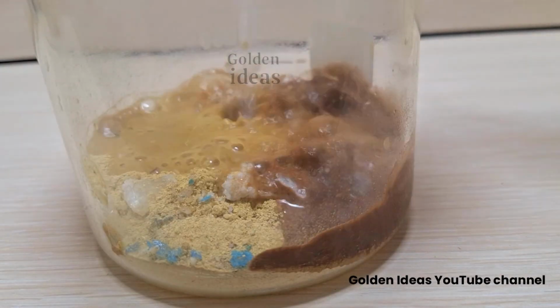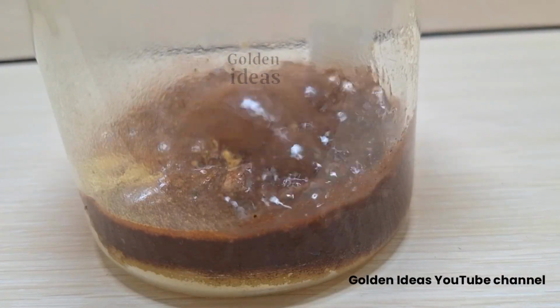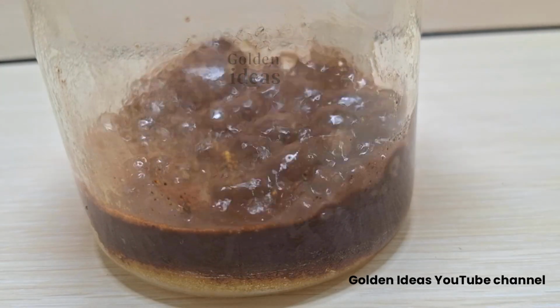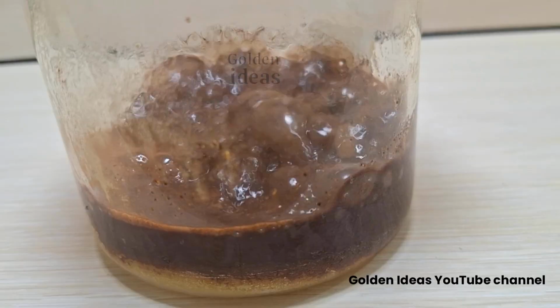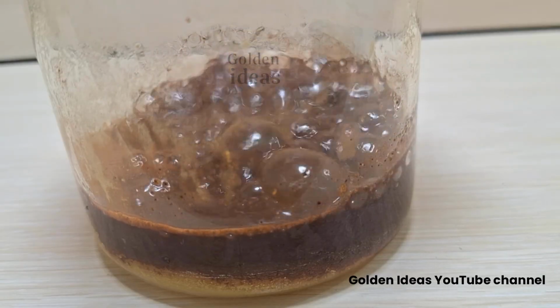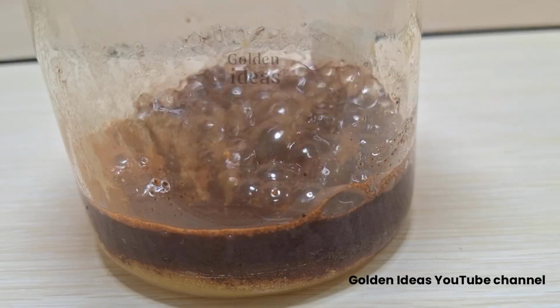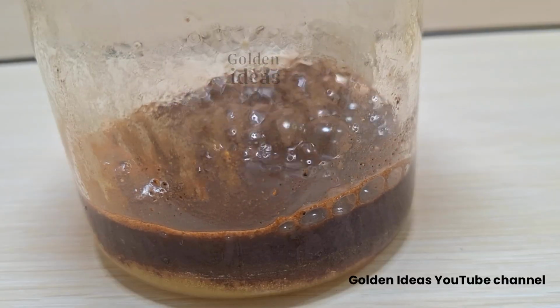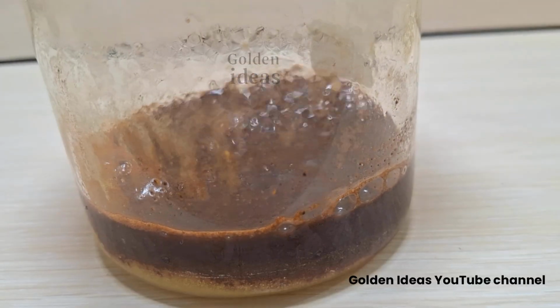Now slowly add hot water. Although acid and dangerous substances are not used in this test, it is better to use appropriate glasses and air conditioning. Stir the solution several times until the ingredients are well combined. This process takes up to 5 hours, and of course, the longer it is, the better.